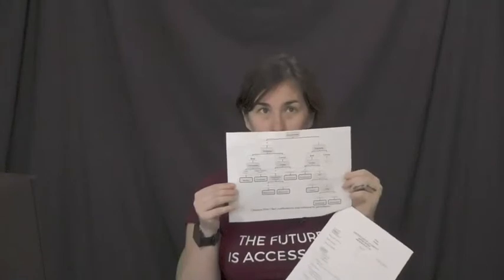So after you've gram stained, made a plate, and gram stained your plate, then you're going to know what tests you need based on this flow chart here, which is exactly what's in your packet. It's just not in color. Okay.